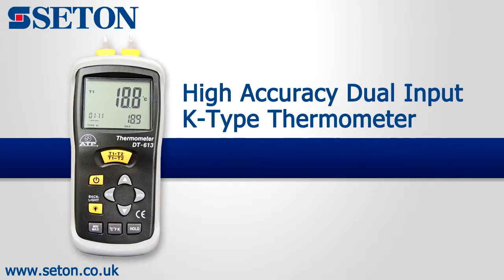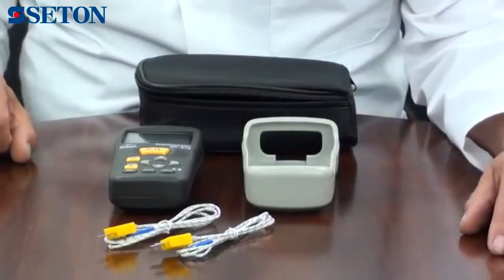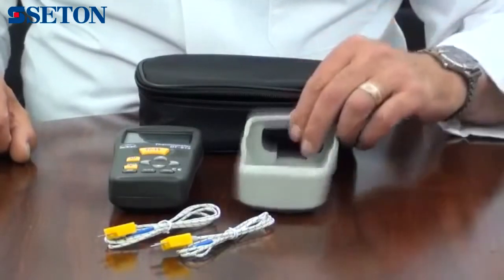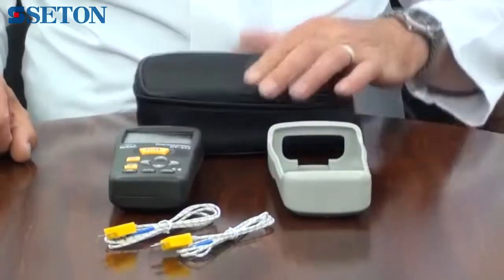An introduction to the TK613 Dual Input High Accuracy K-Type Thermometer. It is supplied with two 1m long plug-in wire thermocouple probes, a rubber protective holster, a soft carry case and battery.